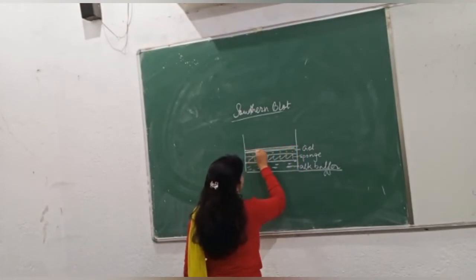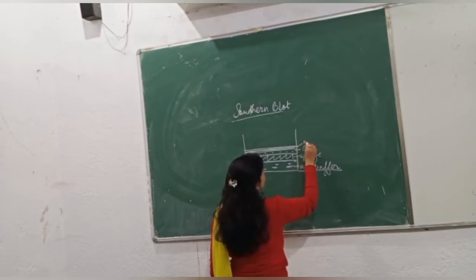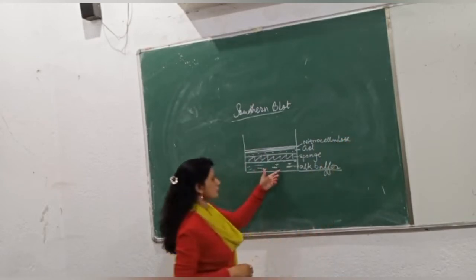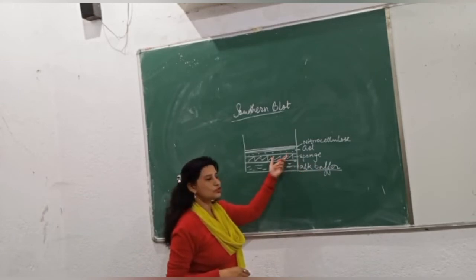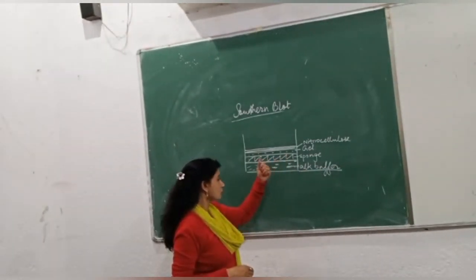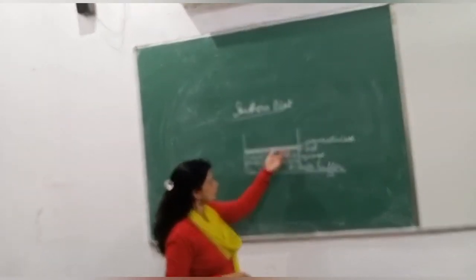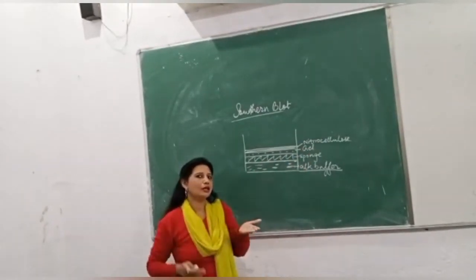The membrane is sticky and adhering in nature. It is very sticky in nature. This membrane is the nitrocellulose membrane. So what is the structure? First I put the buffer region, which is the alkaline buffer, and the sponge is placed on top so that it soaks in the water, and then the gel, which is agarose gel, and the gel and the nitrocellulose membrane should be completely aligned.